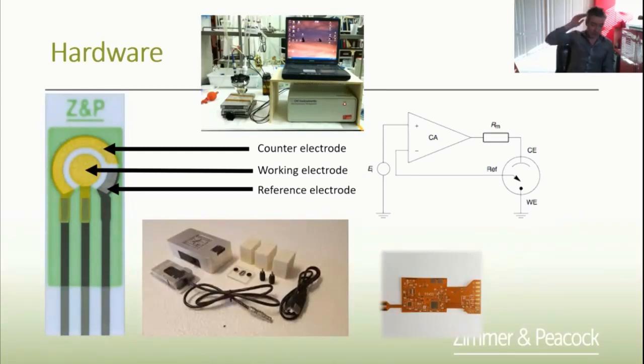Now, if you were into biosensors, and you enter a lab that is developing biosensors on instruments like this, the kind of instruments that we like to develop on are very small instruments. This is the beauty of electrochemistry, and this is the beauty of doing biosensor development: the scientific instruments needed to perform electrochemical experiments or biosensing applications are very small.